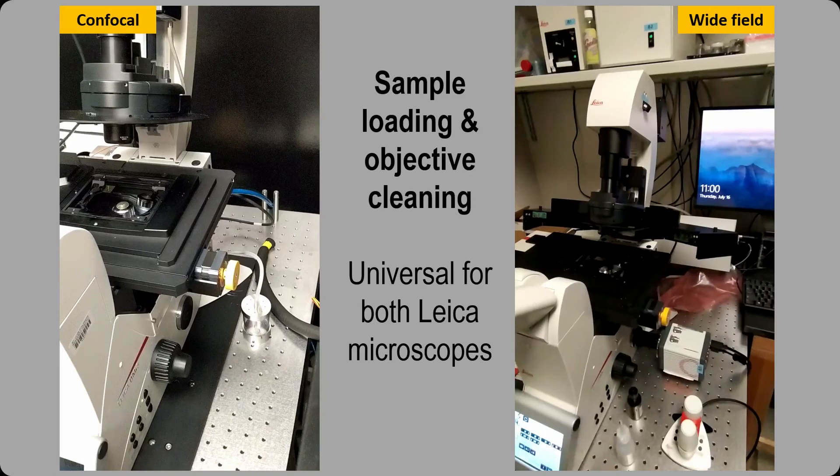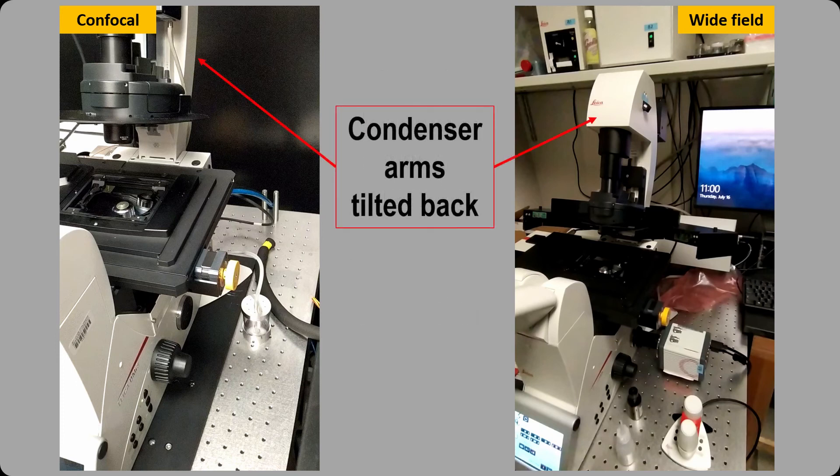This video tutorial is about how to load a sample and clean an oil objective. These procedures are universal for both confocal and wide-field Leica microscopes. On either system, the condenser arm should be tilted back before loading the sample.